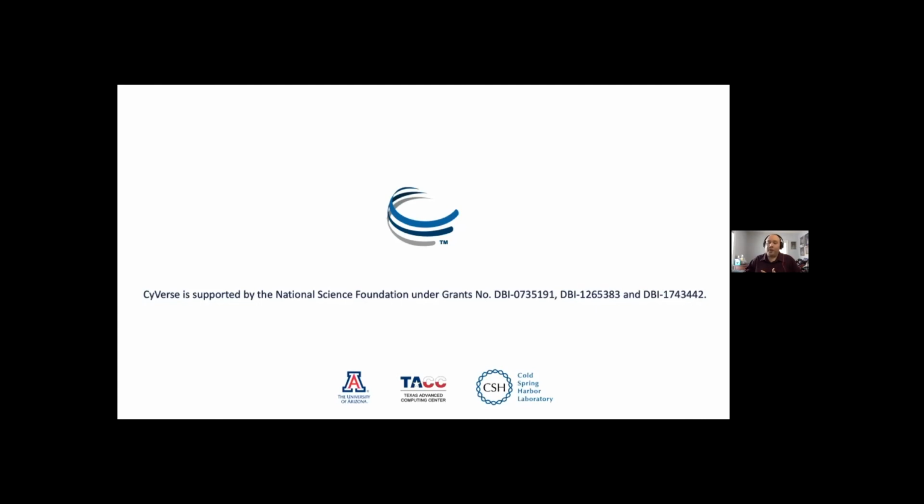A lot of these programs, maybe not the ones I've focused on as much, but others will be very useful for haploid data. And so I think just make sure that the inputs are specified. This is one case where running things on the Discovery Environment may not be your best option, because you may need to add additional flags that are not standard. For the R scripts and the R analyses, you can modify those real easily. So that should be there, but for others, I would look into the program to see if you can specify a ploidy. In most cases, you can.